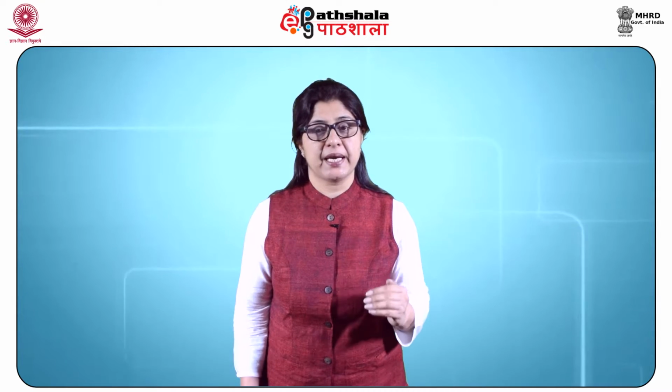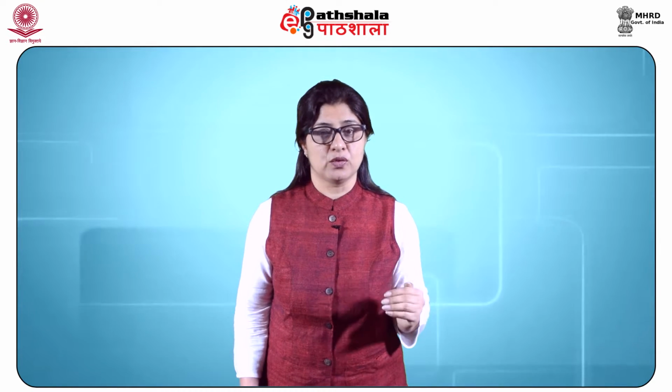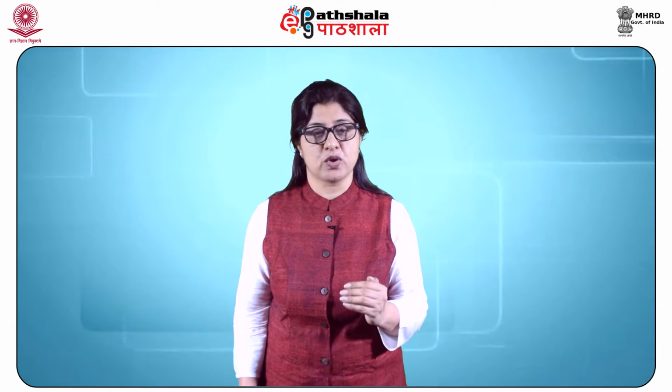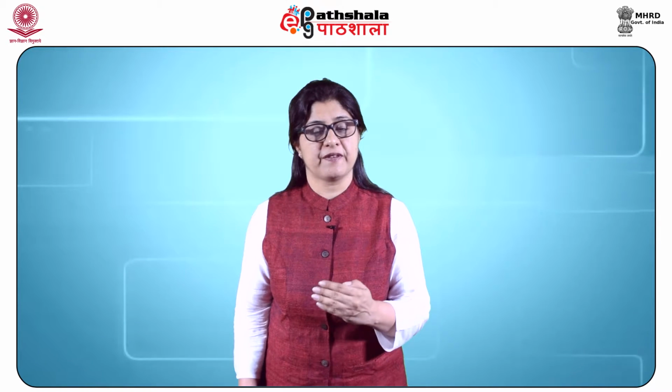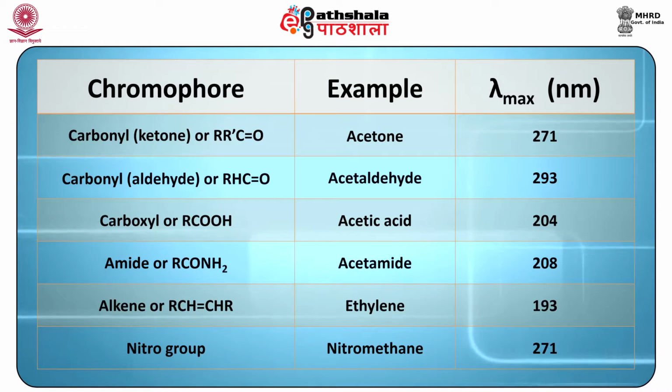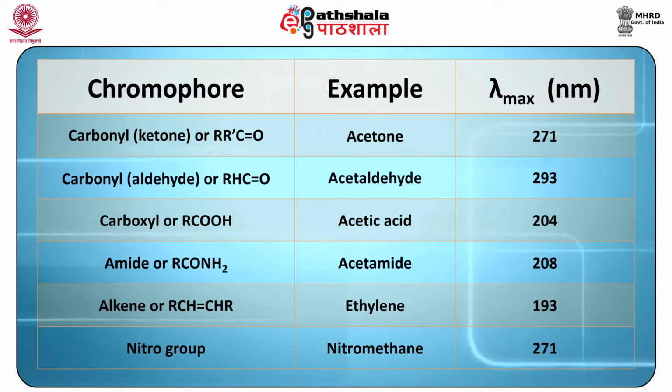Most of the absorption bands in the UV visible spectra of various compounds result from the presence of unsaturation in their structure. A chromophore is a molecular group which is responsible for absorption, usually containing an unsaturated bond. When inserted into a saturated hydrocarbon, which exhibits no UV visible absorbance spectrum, it produces a compound with absorption between 185 and 1000 nanometers. Some common chromophores and their absorption maxima are listed here in the table.